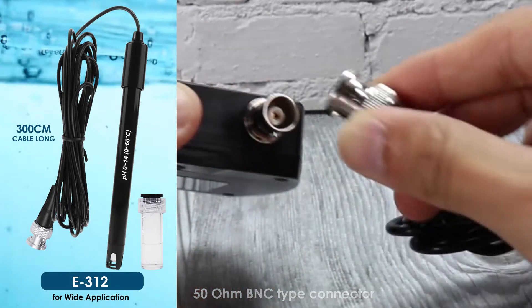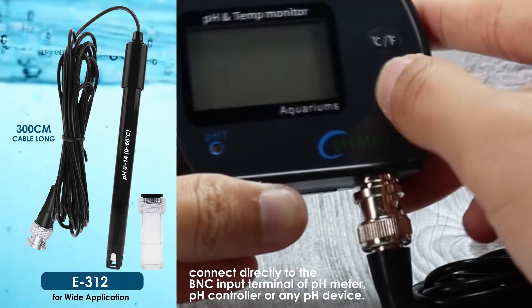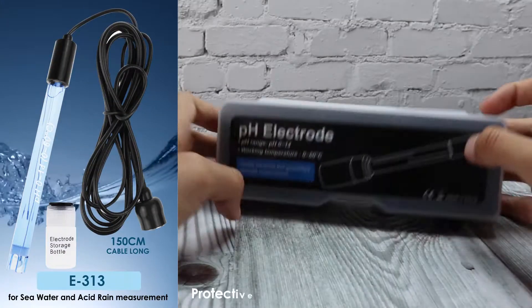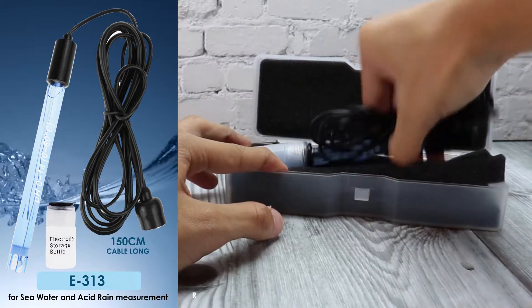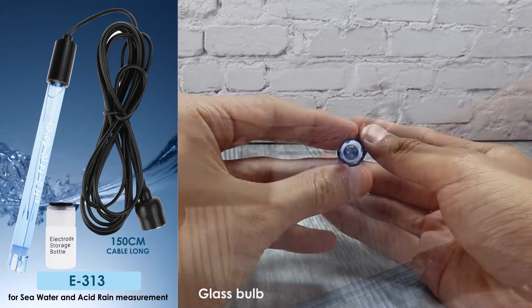E312 connects directly to the BNC input terminal of any pH device. E313 comes with a 150 centimeter cable and can measure sea water and acid rain. It includes three pH powders and its own storage bottle, and connects directly to the BNC input terminal of any pH device.